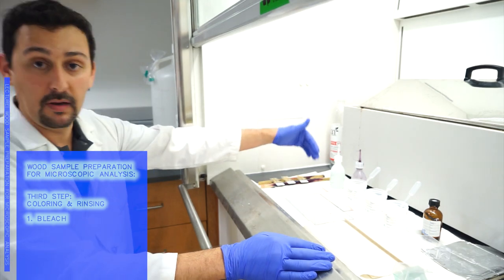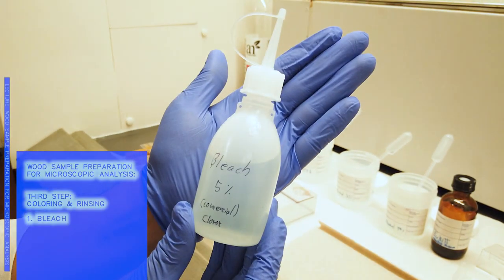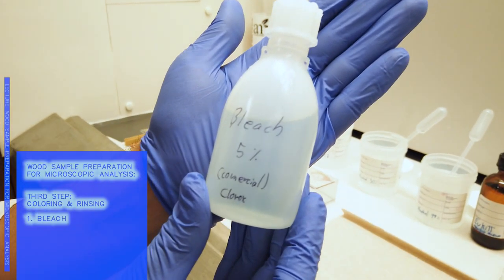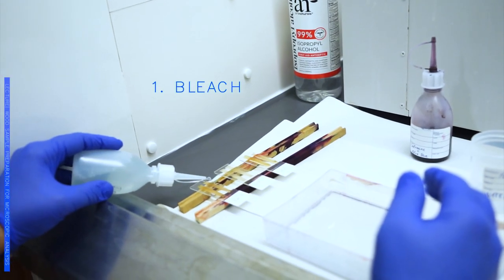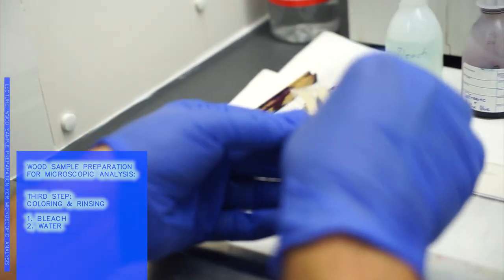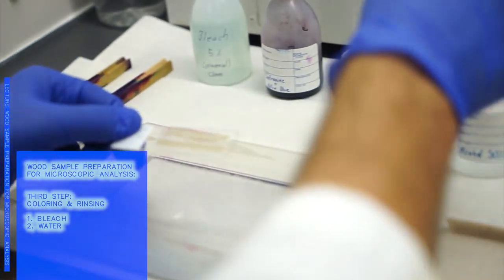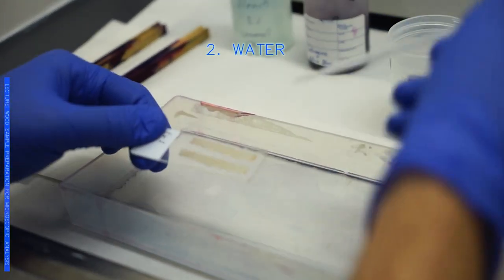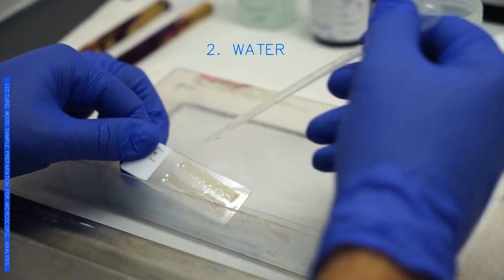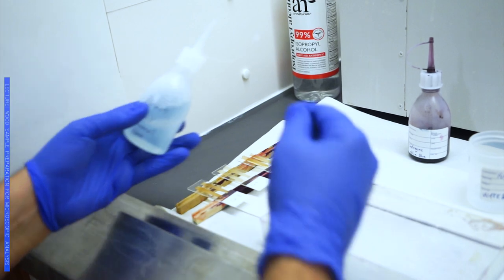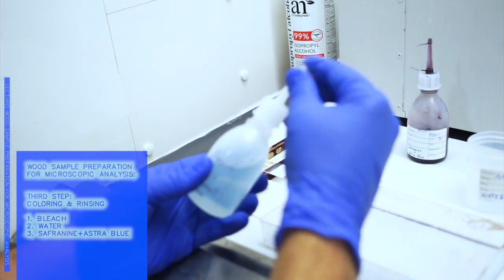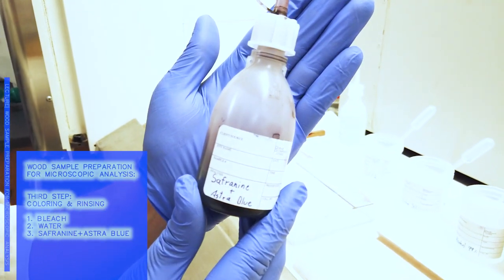First step, we will put some bleach in our samples because that will help the color to stick on our tissues. After that, we will wash out the bleach with a bit of water. Then we will go with our main colorant that we use, that is Safranine and Astra Blue. Safranine is a red colorant that will attach itself to the lignin of the wood while the Astra Blue will attach itself to the cellulose.